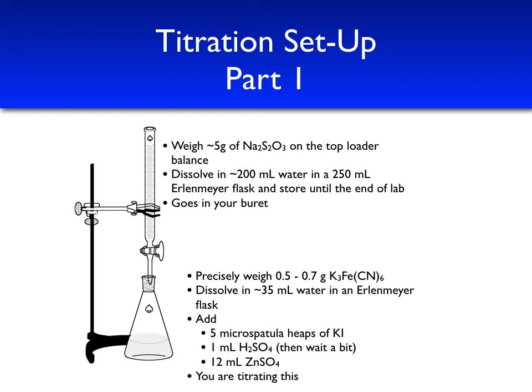Remember that when we rinse a burette, we want to rinse it once with water and maybe once or twice with the solution that we're titrating with, so that the burette walls are coated with sodium thiosulfate. We will do 3 trials of this titration.